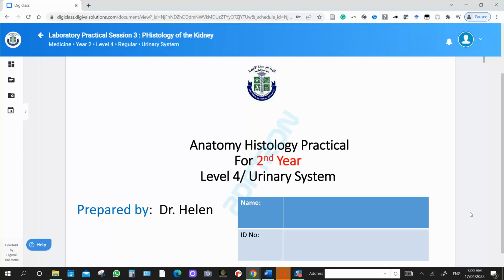Hello dear students, this is a short video to explain to you about the lab histology practical for urinary system.